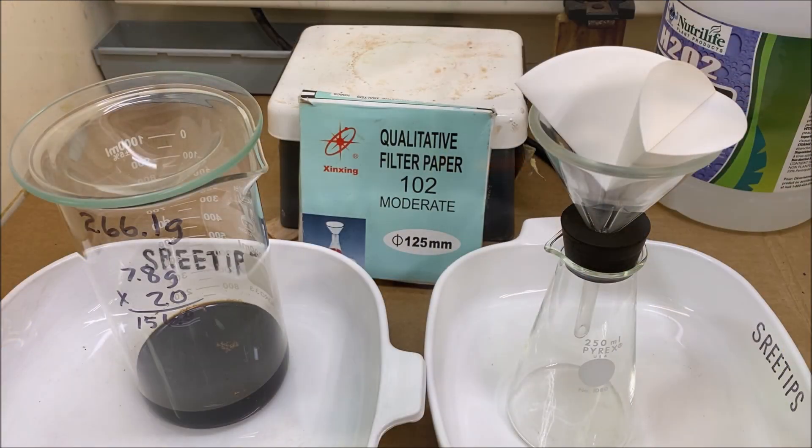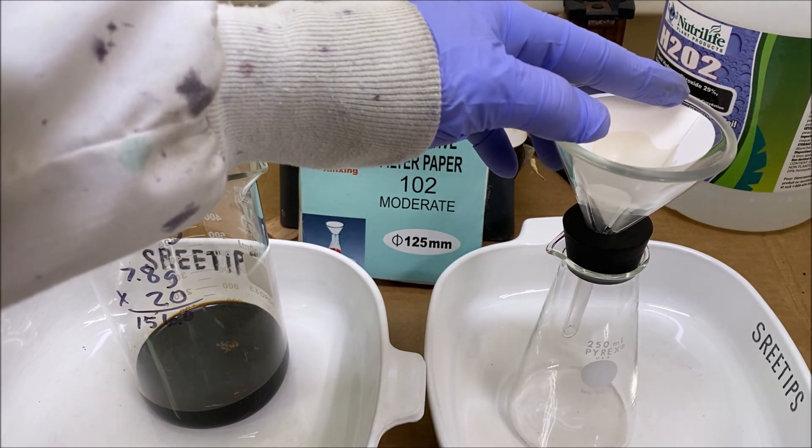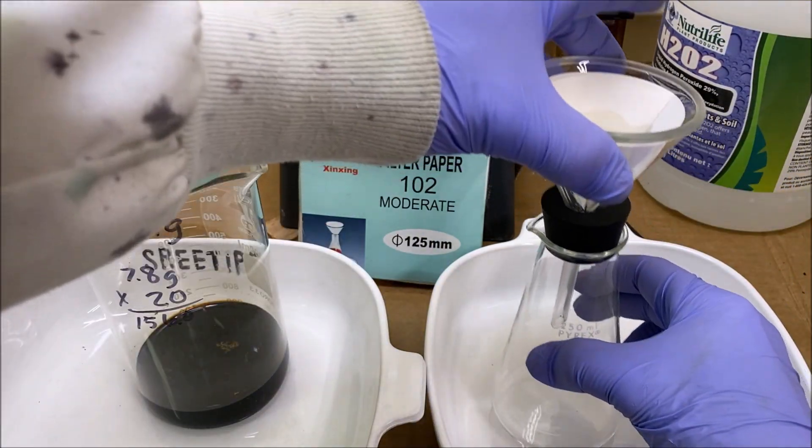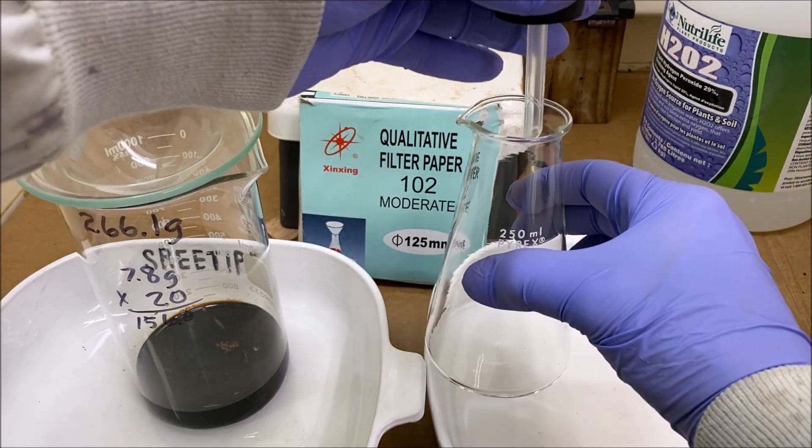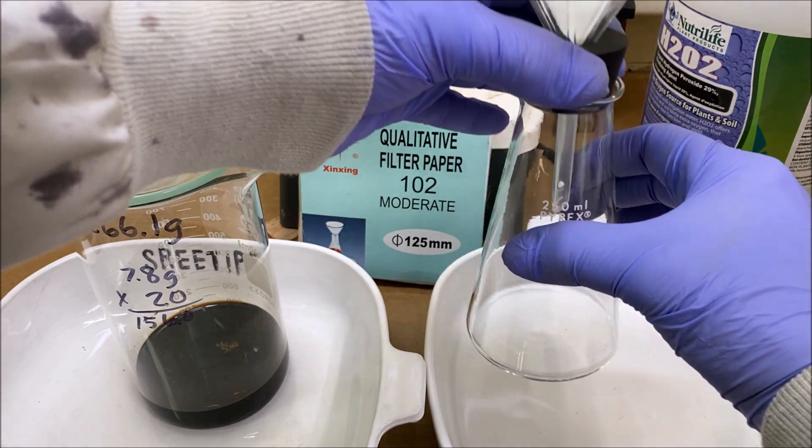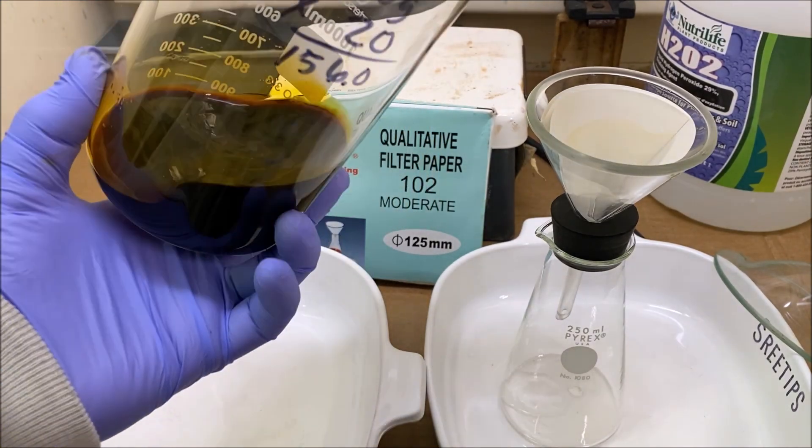Now what we'll do is filter our solution through this funnel into a fleeker, it's neither flask nor beaker. Here's our solution to the platinum metals.